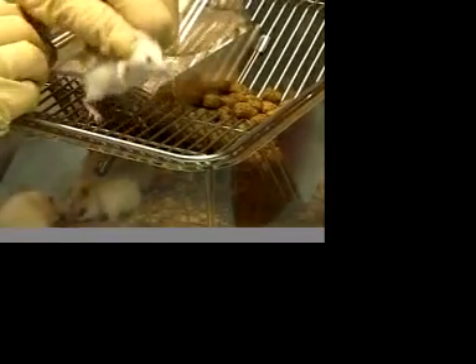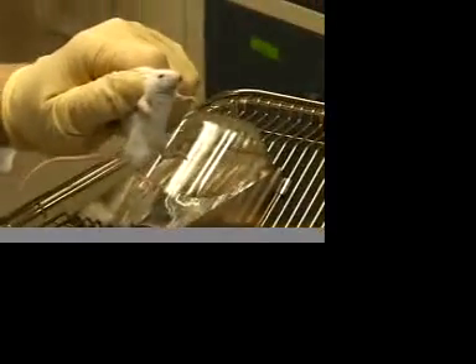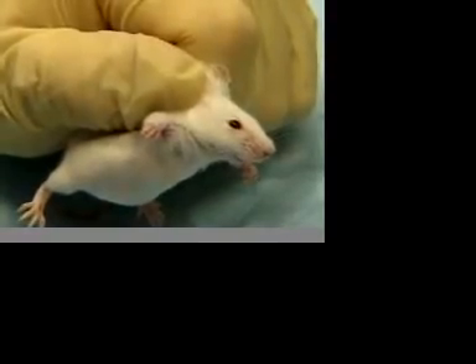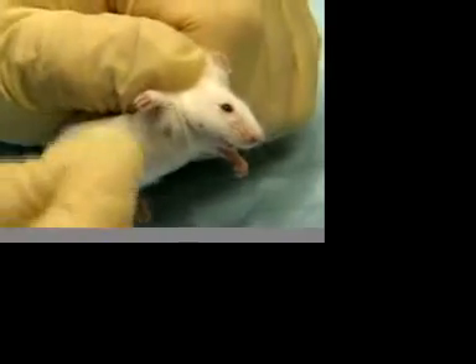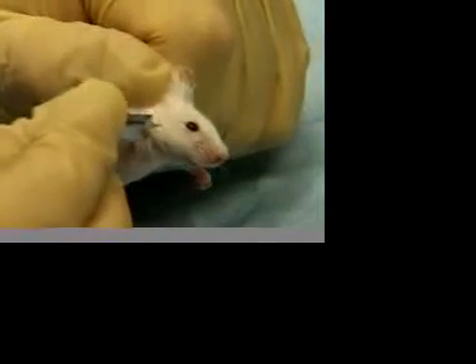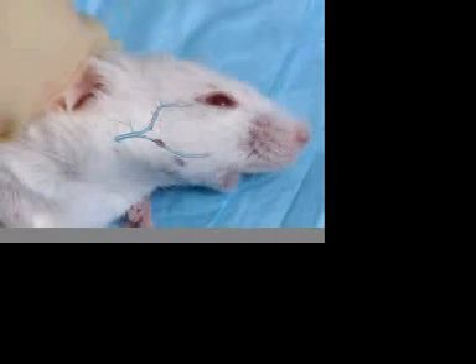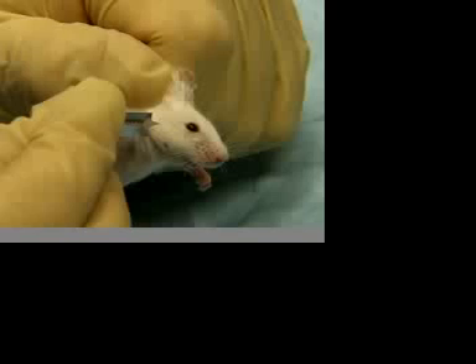Hold the mouse securely by the scruff of the neck so that the animal is immobilized. The location of the puncture is easy to find — it is located at the rear of the jawbone. We are aiming for the lower portion of the facial vein that drains the eye, the rear portion of the submandibular vein, or the junction of those veins and the jugular vein at the rear of the jawbone.